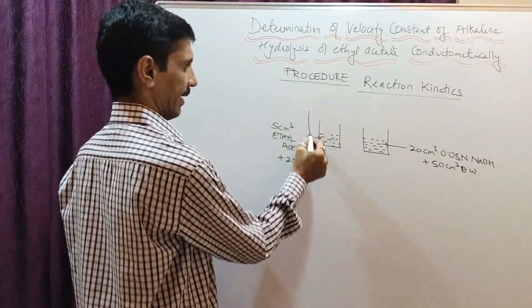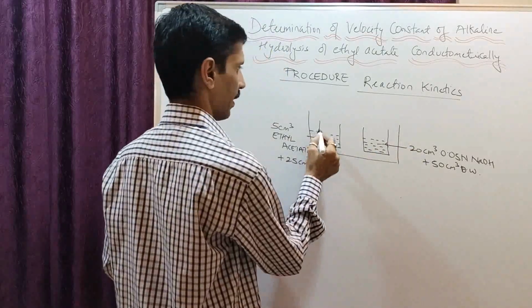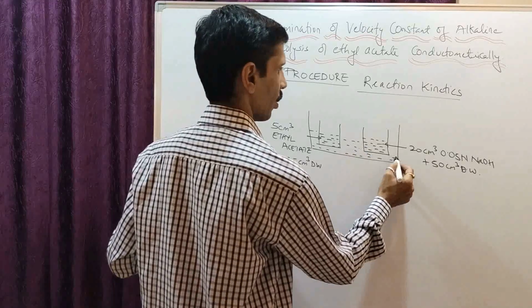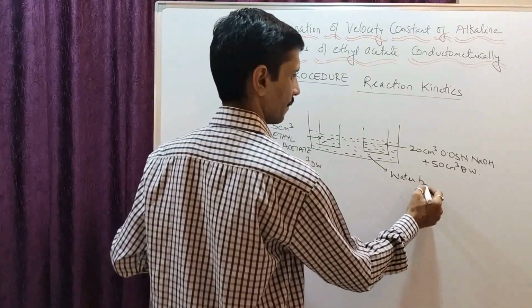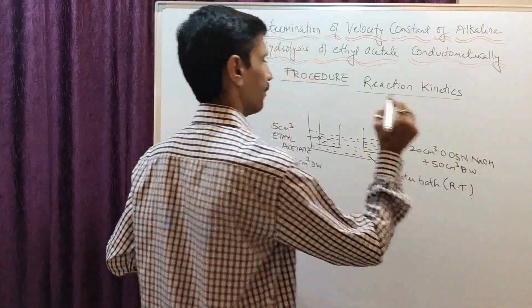The entire assembly is placed in a water bath to attain room temperature.